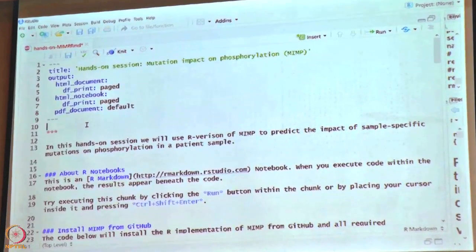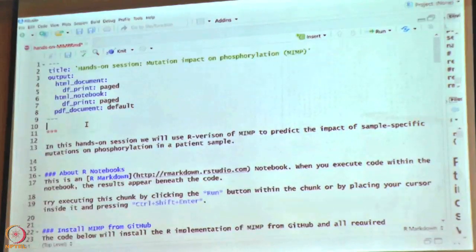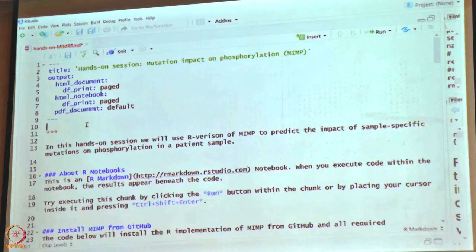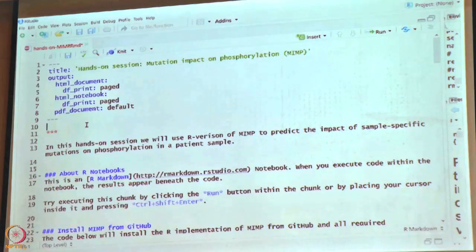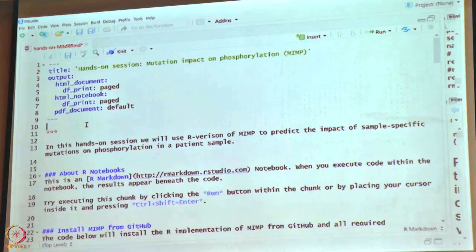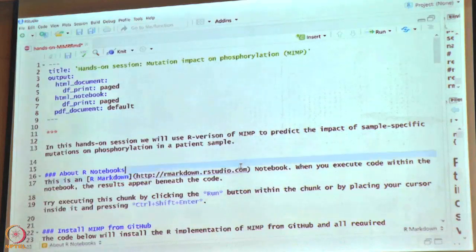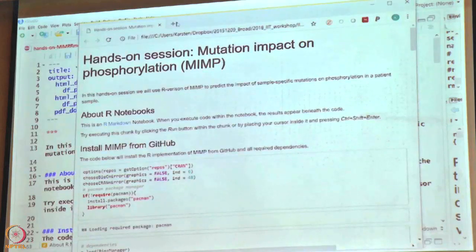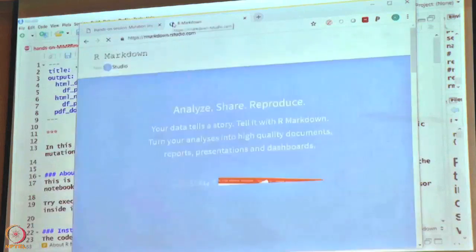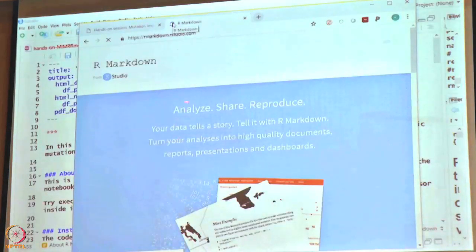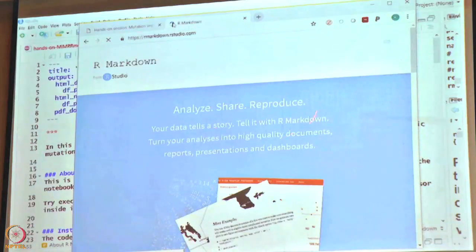What you're looking at is an R notebook — R code intermingled with plain text. Markdown is a very simple text-based format to create structured documents or HTML pages. There are extensions that allow you to execute code within these markdown documents. There is a link about R notebooks, and clicking it will give you more information. This is a very convenient way to document your analysis results and code, and to share with collaborators.